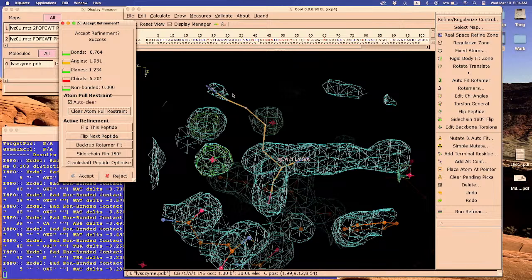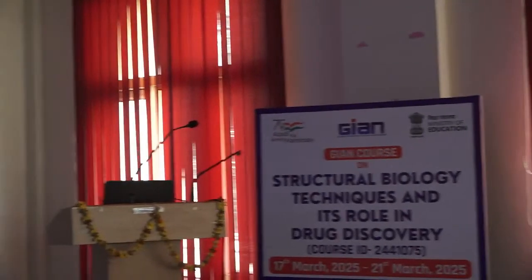Okay? And then go to Draw, Sequence View, the protein. So you now have the sequence. Click on valine, the first valine, and then zoom in. You know how to zoom in? It doesn't zoom in like that. So you have to know how to control your trackpad. This is the right button in a three-button mouse. If you don't have a mouse and you don't know how to control the trackpad, it's going to be very hard.